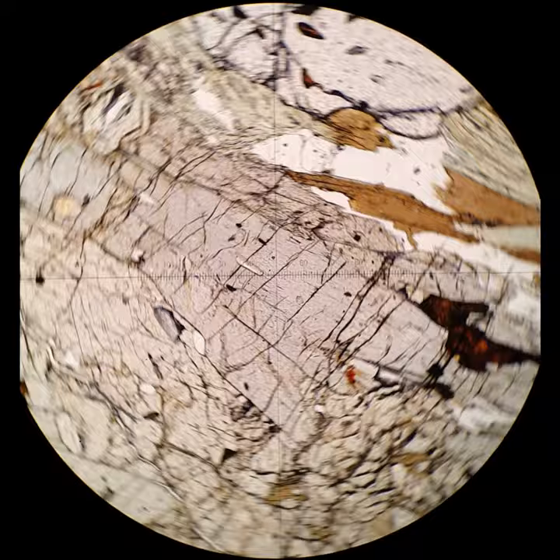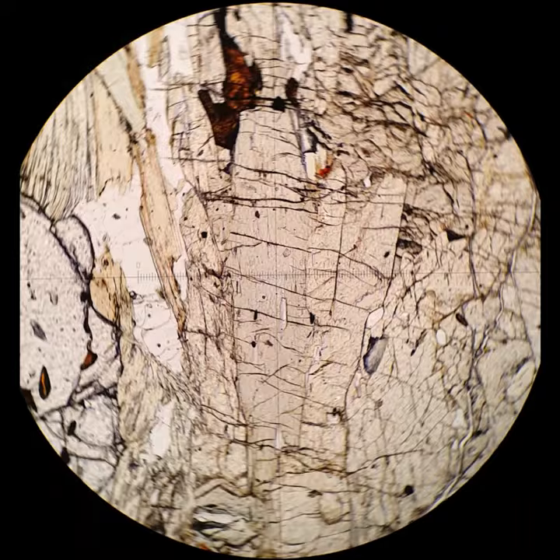So, this is gedrite. It is gray, pleochroic, so darker running east-west than north-south, so normal pleochroism. And after I cross the polars, you will see that it has parallel extinction right there.